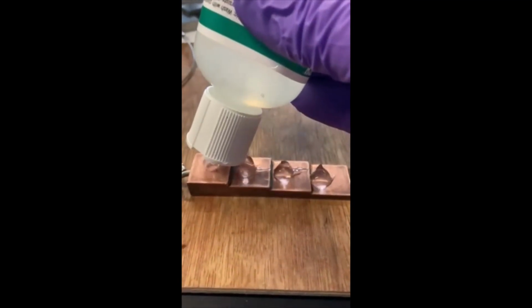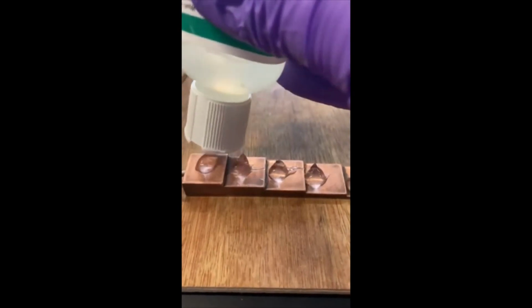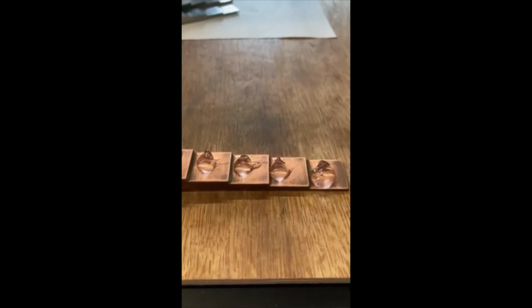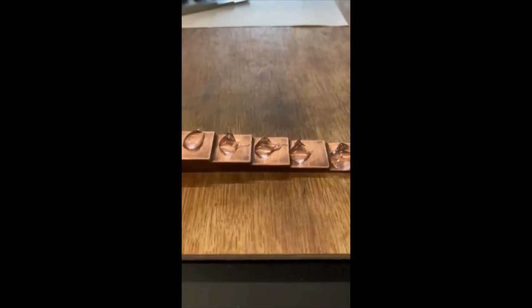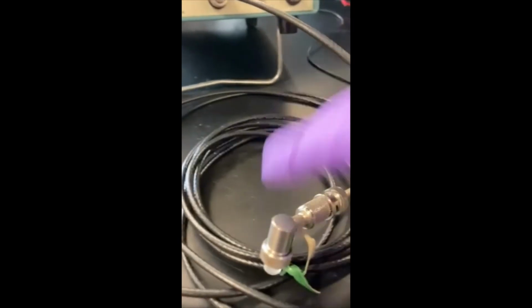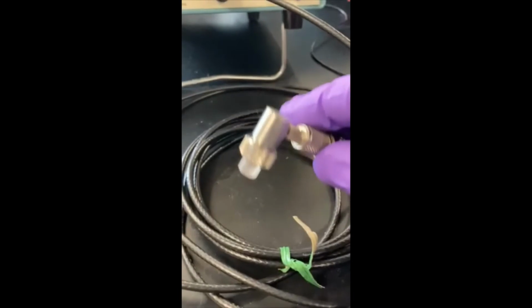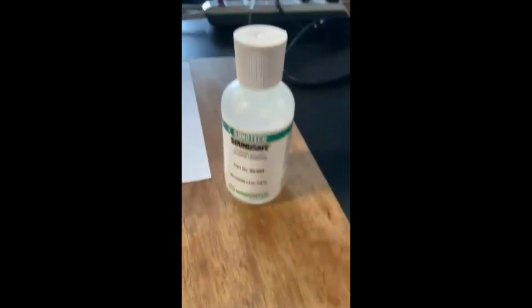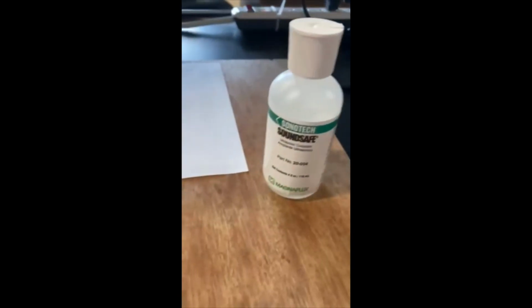To ensure that we get good coupling between the transducer and the sample surface, we use a very high viscosity coupling gel that eliminates the air gap between the transducer head and the sample surface. This allows the ultrasonic pulse to be more effectively transmitted through the sample. We place the transducer into the couplant and then press it firmly against the copper surface.